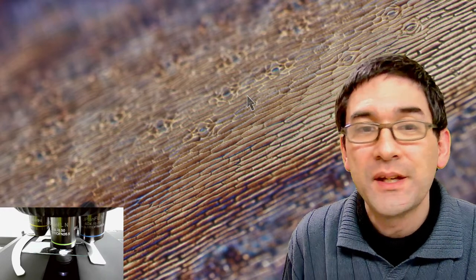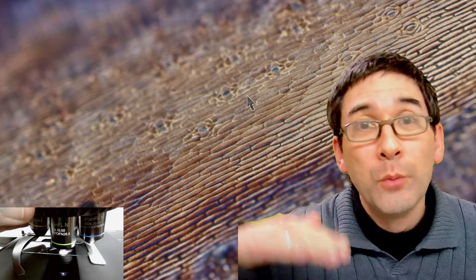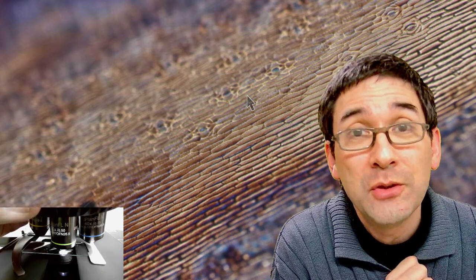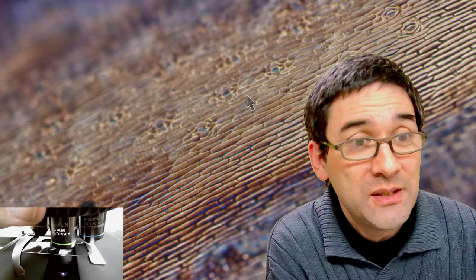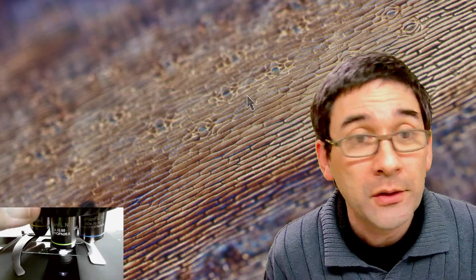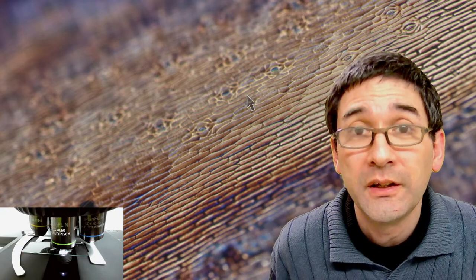Would the image be better with a cover slip over the sample? Well, the image would be more flat, but the problem is it's quite thick, and it's not the cover glass that would improve image quality — I'd have to add some water. The problem with water is that it's going to dissolve the glue. For this reason I'm simply doing it dry.